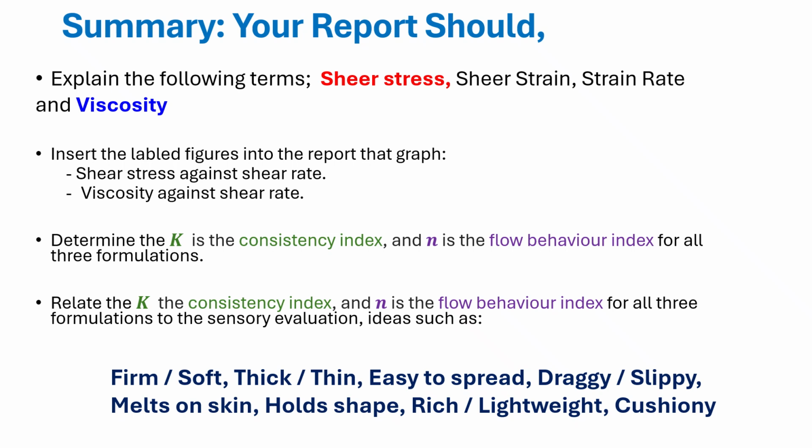Okay, so it's really important to try and move just beyond 'these are the numbers the test gave'. We want that to be related to how a consumer would perceive this product when they actually get hold of it. Now please remember, I have attempted to make this a lot easier for you by removing the plastic behaviour, but it's also removed the yield stress, and that's really how the product feels when it's first taken out of the jar. So that's been removed for you. It does make the graphs much easier to interpret. It makes the process a lot easier.